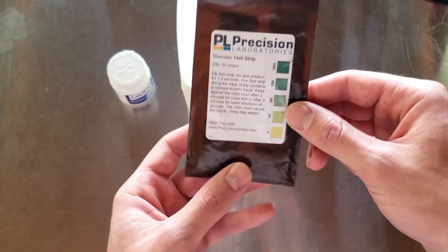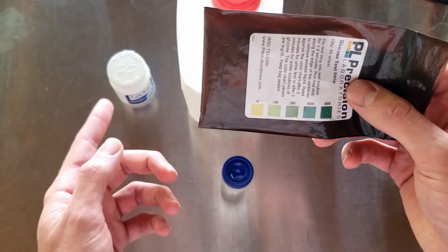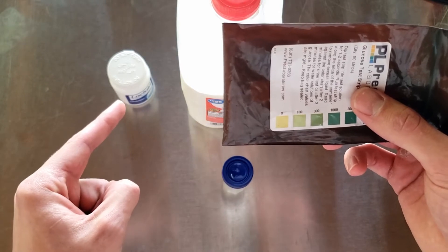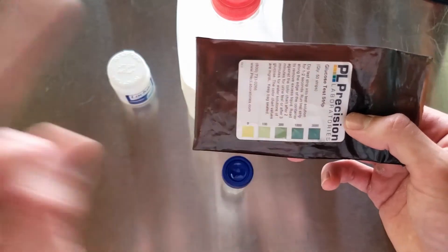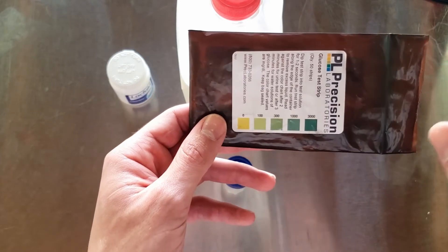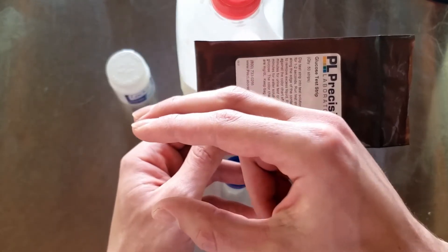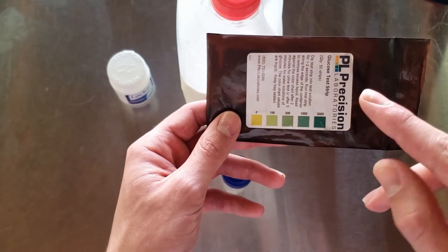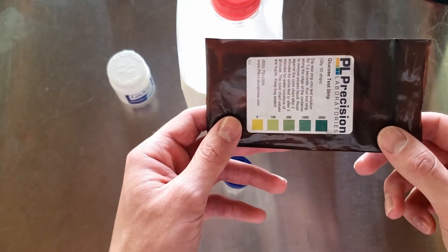What this is going to tell us is how much glucose is present after we break down the lactose. We're breaking down the lactose into glucose and galactose with the lactase enzyme, and then we measure the glucose. From the glucose, we can calculate how much lactose was originally in our food product. The important thing to note is there's going to be twice as much lactose as glucose, because we're splitting lactose into two subunits — so the glucose we measure needs to be multiplied by two to get the lactose content.